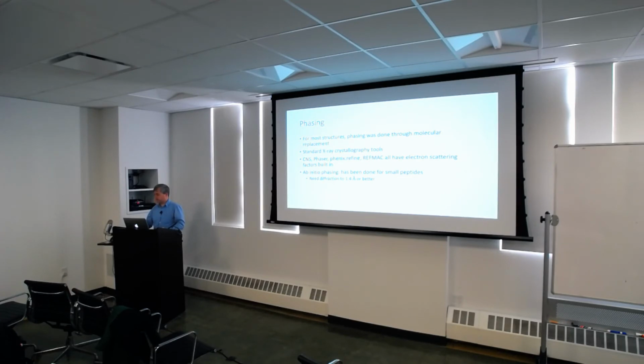I guess maybe you mentioned this already, but it's a projection, right? So to get 3-dimensional phase information, you want the 3-dimensional transform, or the 3-dimensional image, I guess. Maybe if you did a tomogram first, then you might be able to get the phases. Reconstruct the crystal itself, perhaps. I don't know. Basically the phasing problem is a problem. Apart from the ones they've done ab initio, these small things, they've only done molecular replacement.